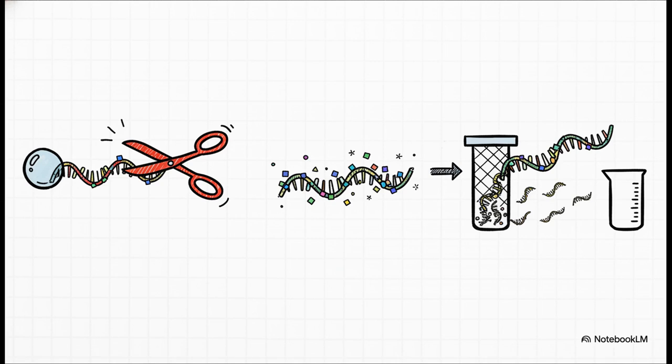So just to sum up those final steps, first, cleavage, cutting the DNA from the bead. Then, deprotection, taking off all the leftover chemical caps. And finally, purification. The whole mixture is run through a system that separates our perfect, full-length DNA from any of those capped-off failure sequences, leaving us with a pure, high-quality final product.